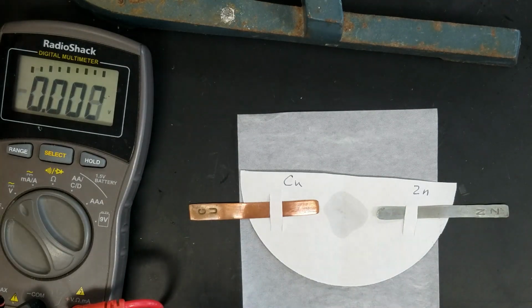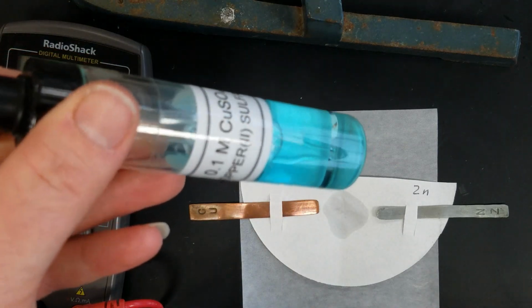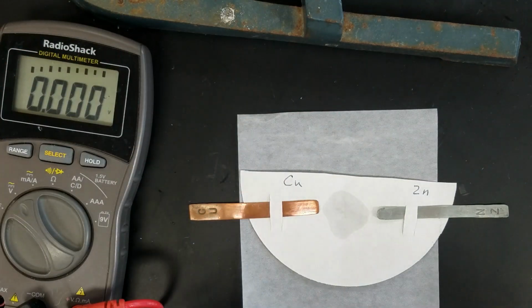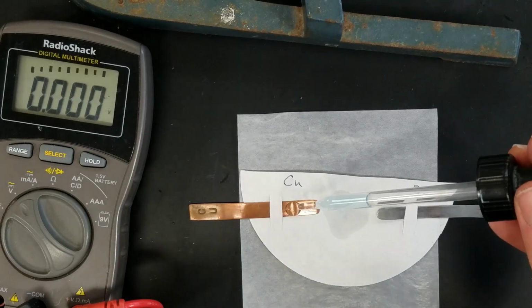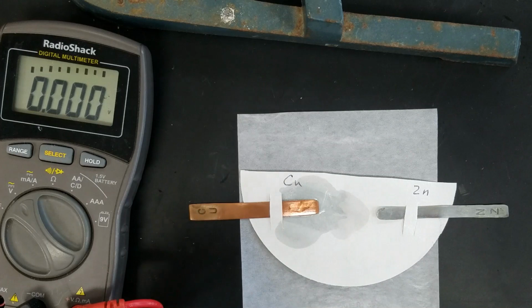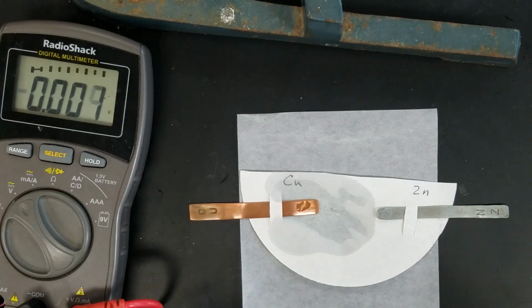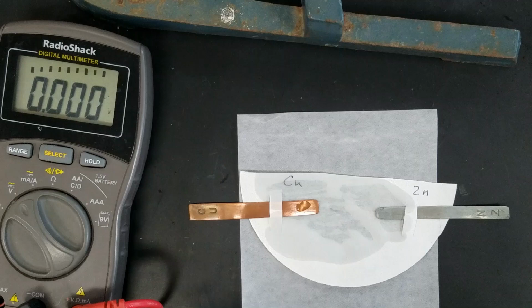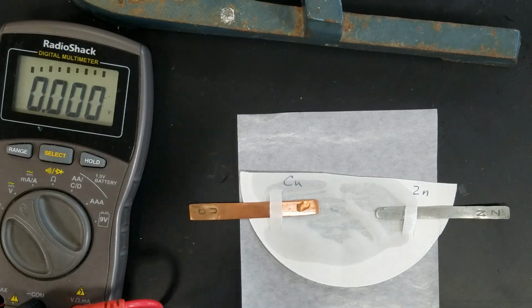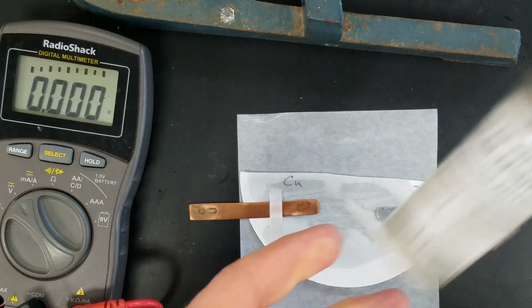We're going to add a copper solution to the copper side of our galvanic cell, and we're going to add zinc solution to the zinc side. Our salt bridge solution that I already added is ammonium nitrate.